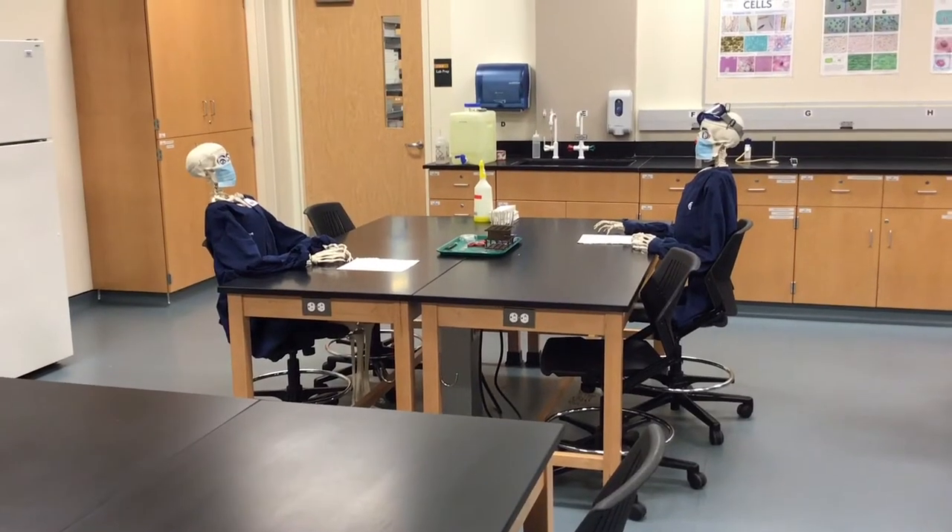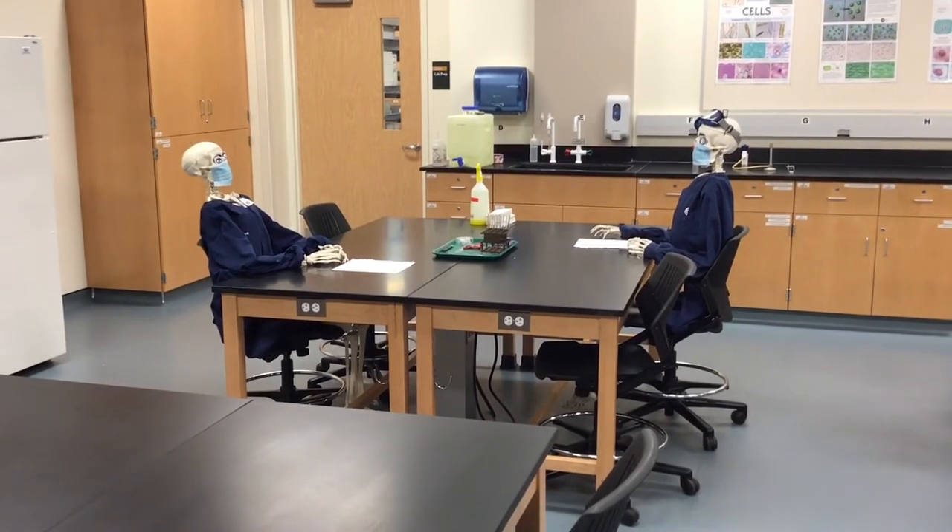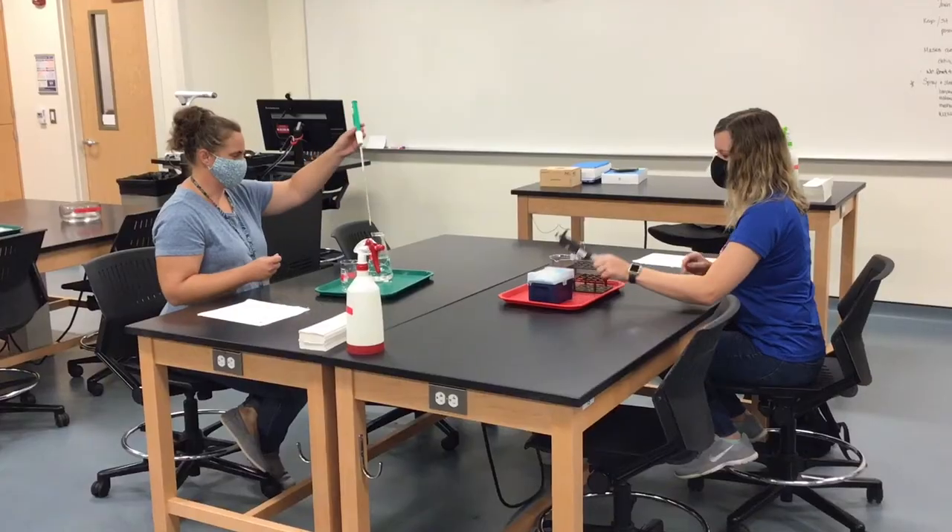There you go, Skelly and Shelly — six feet apart, masks on, no food and drink. Now we're ready to start our lab.